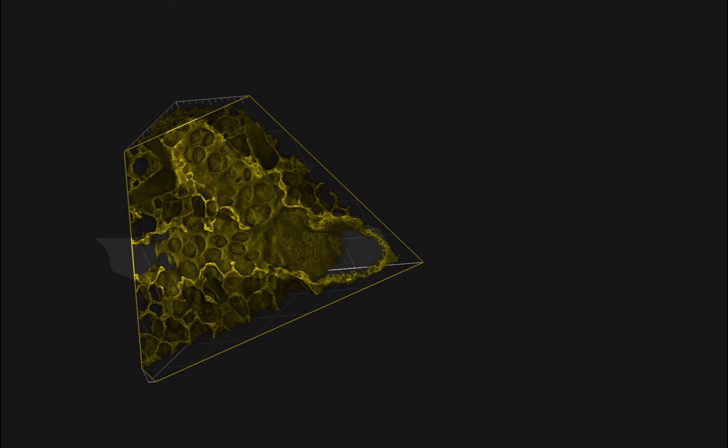And so we think that rather than these air sacs arising by septi arising from the bottom of pre-existing spaces, we think actually that these, at least these particular ones, were extruded from the side of the airway, which is a rather novel view of air sac formation. So around here is the bronchoalveolar duct junction. These are the distal ducts, and these are alveoli coming out of the side of the airway.